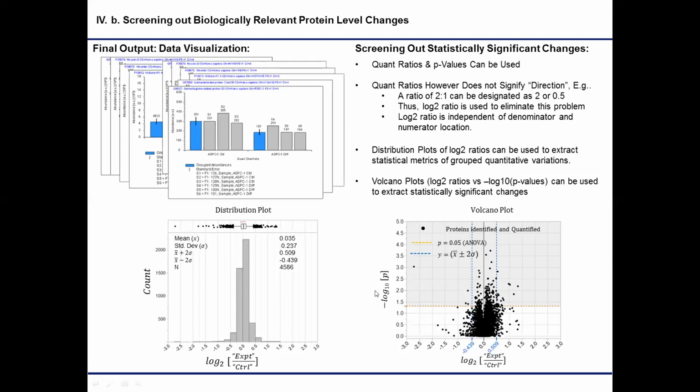So Sarah asked if it's usually normally distributed. I think you did mention that, right, Aruna? Yes. It is not very normal, but it seems like it is normal. But particularly in phosphoproteomics cases, you would see so many over here and very few over here. It all depends on how you visualize the data. It also depends on the biology. Exactly. If you look at phosphoproteomics data in the context of something like DNA damage, you will not have a normal distribution. I can tell you that without even doing the experiment, because we've seen it plenty of times. So it depends on the biology of the experiment.